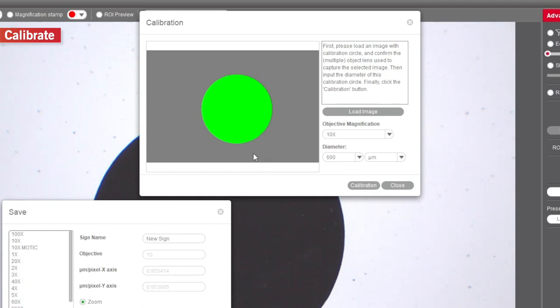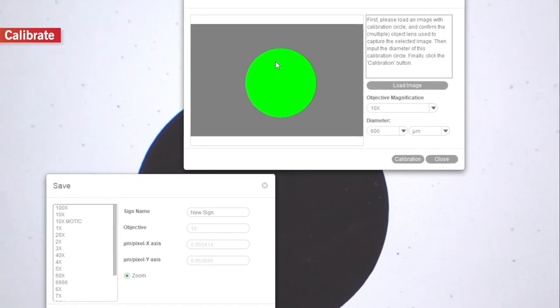Make sure that the calibration circle is shortly displayed completely green. If any irregularity appears, the calibration is not done correctly. In this case, there is a need of adjustments to obtain a perfect cycle. Start again with first steps.